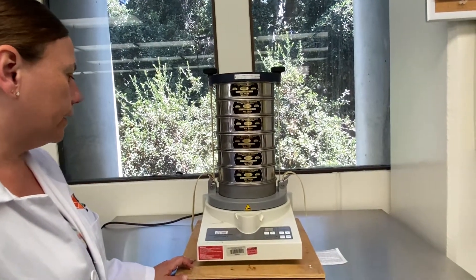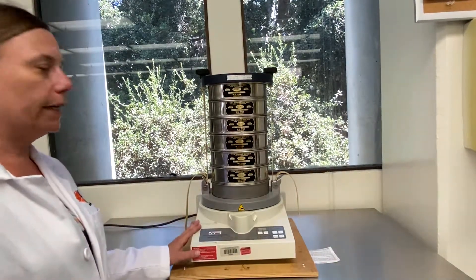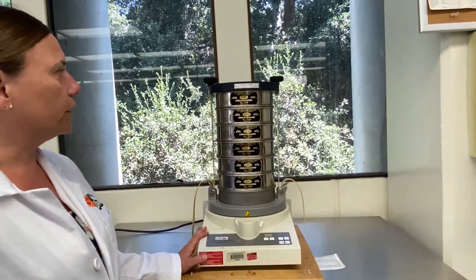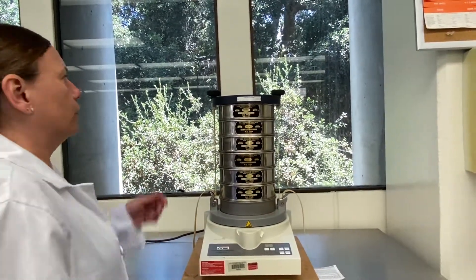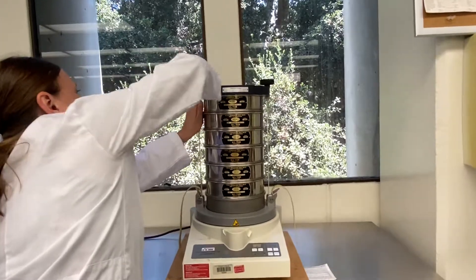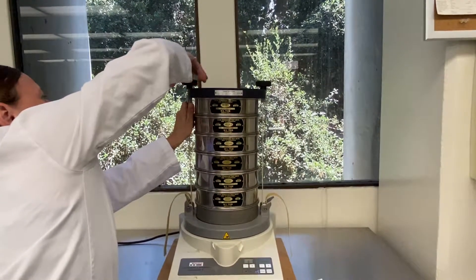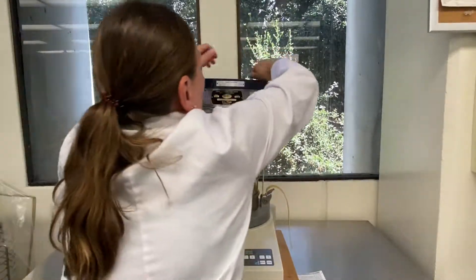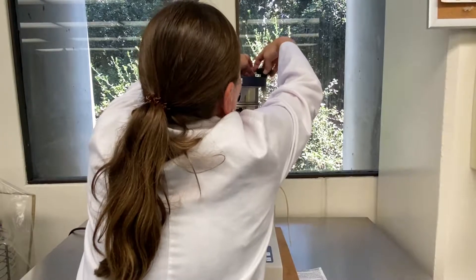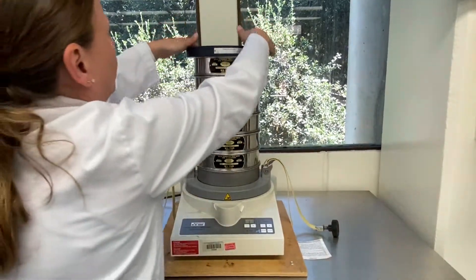This right here is a sieve shaker, and the one place we use this particular instrument is to determine how fine we have ground our coffee grounds. So how we do this is we open up the sieve shaker. When you open the sieve shaker, never undo these little straps down here — always open at the top.